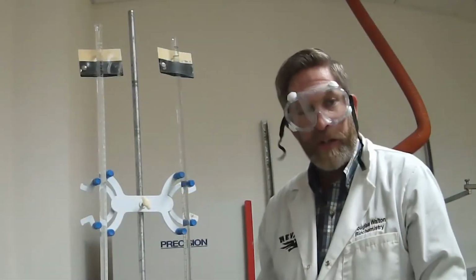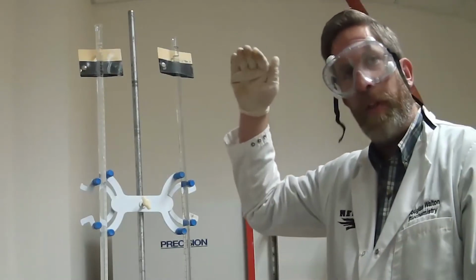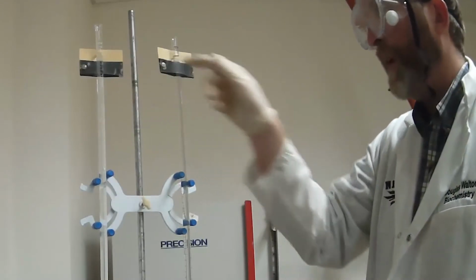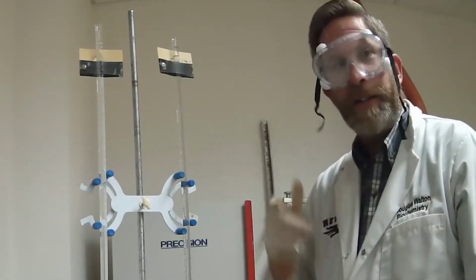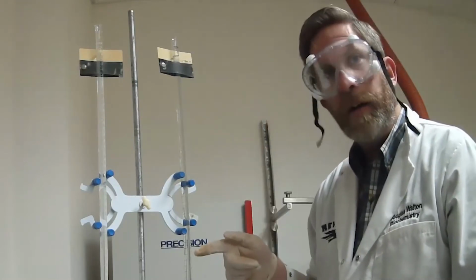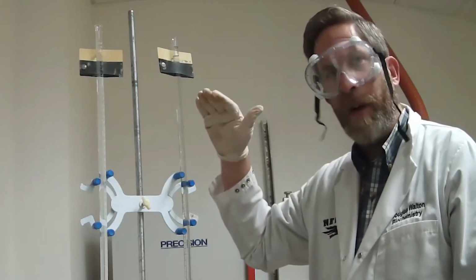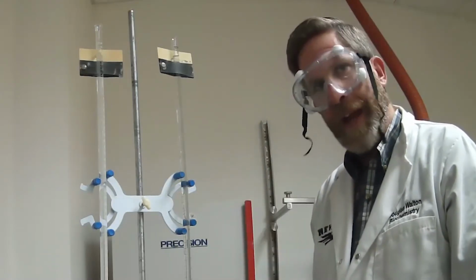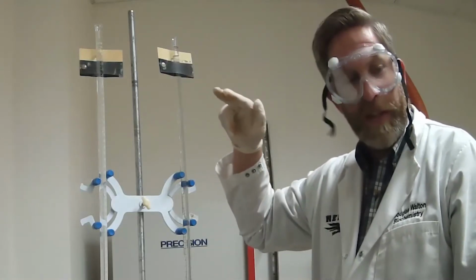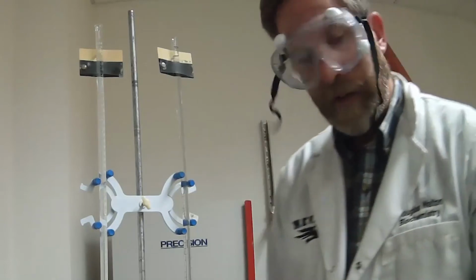Remember, in your titrations, you're going to take two measurements. You're going to take your initial volume, which in both of these cases is 0 up here. We have these handy-dandy readers, which we'll get to in a second. I've just gone ahead and set these both to 0. And then our final volume, which will be somewhere down here. Remember, these deliver a volume, so it's measuring how much we have delivered into our reaction at the bottom. So the final volume minus the initial volume is the volume of titrant used. I can't believe I remember the word titrant.